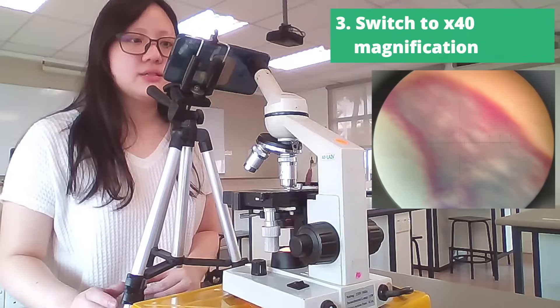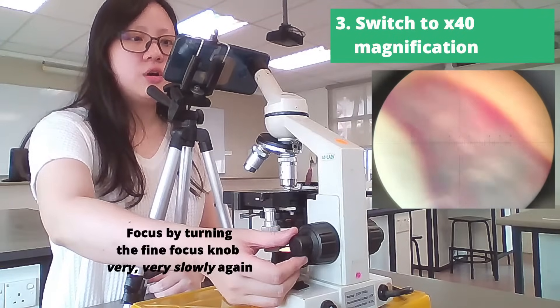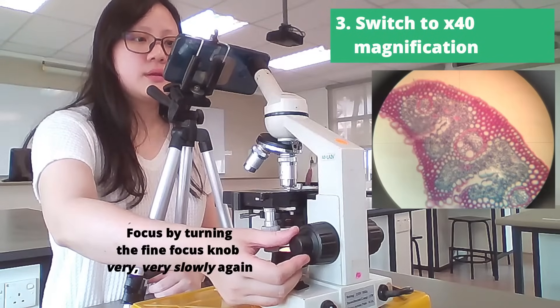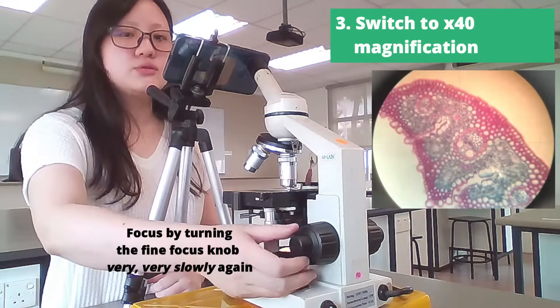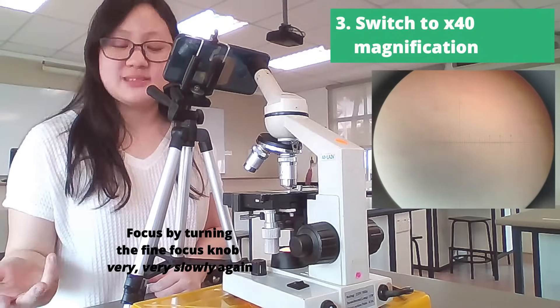Usually it's not completely in focus, but it's almost. So again, we're going to touch the fine focus knob and very slowly rotate it towards you or away from you until it focuses. I emphasize very slowly, because if you rotate too much, it's going to be completely out of focus and it's very hard to find the specimen again.